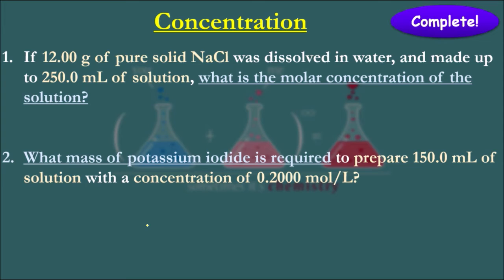Okay, so now that we've gone through the summary of the steps of making a standard solution, let's take this into the context of if we were in the lab and I want to make a solution of a particular concentration. What are the steps that I go through? What calculations do I have to do as well?